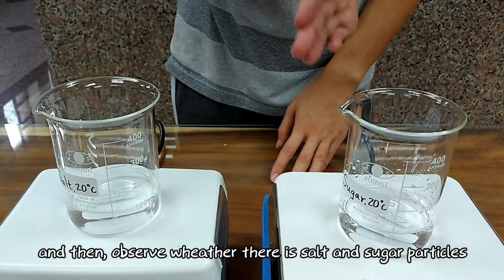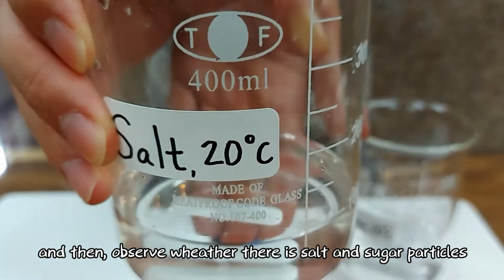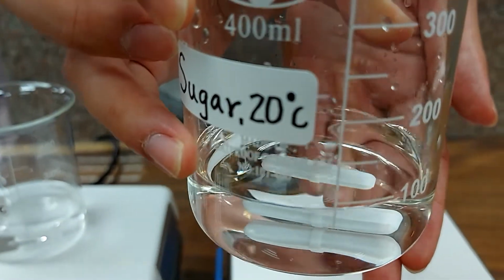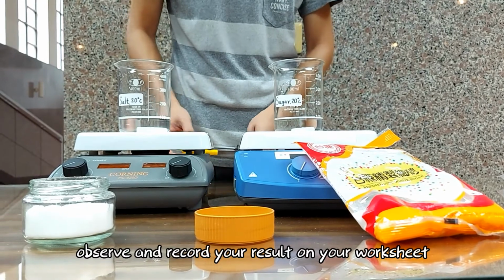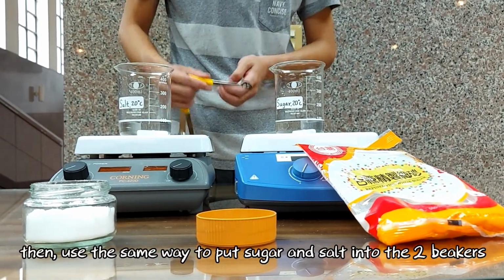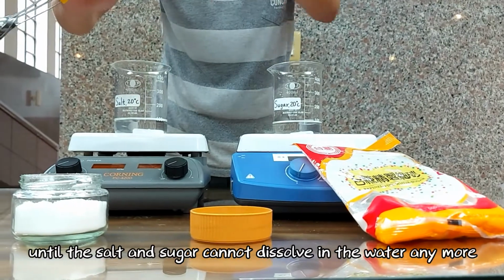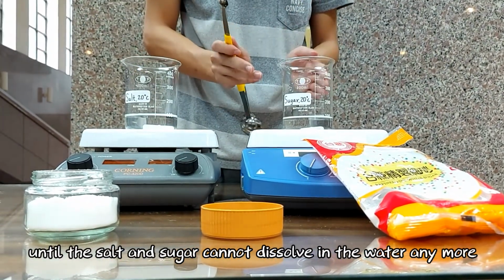And then, observe whether there are salt and sugar particles in the water or not. Observe and record your result on your worksheet. Then, use the same way to put sugar and salt into the 2 beakers until the salt and the sugar cannot dissolve in the water anymore.